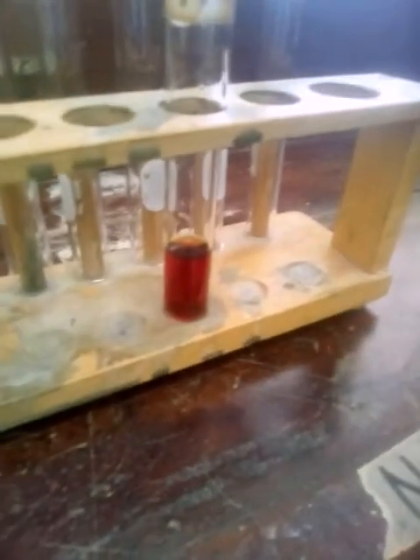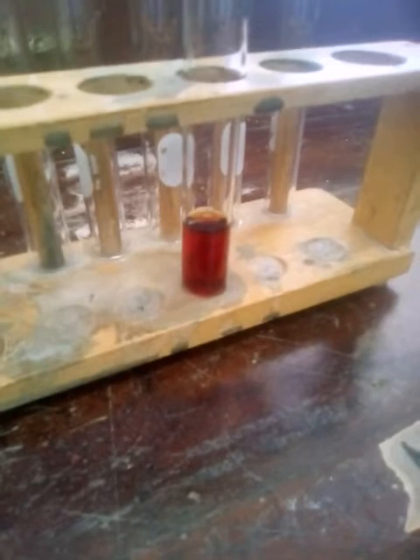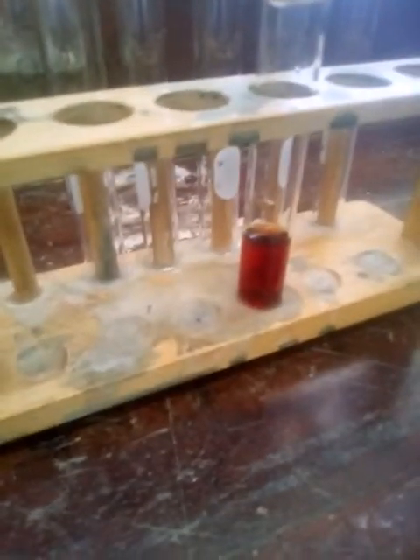You can describe this color. You can always use your literature review to describe this color, but in my opinion, I would say this is a dirty orange brown, a reddish brown.